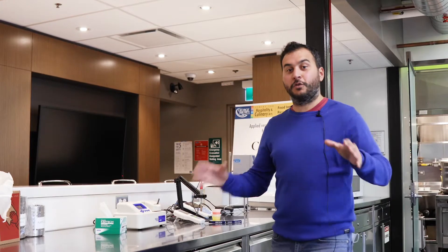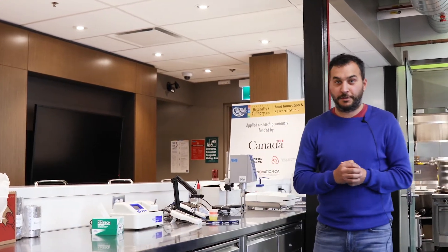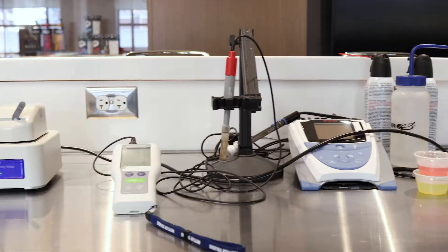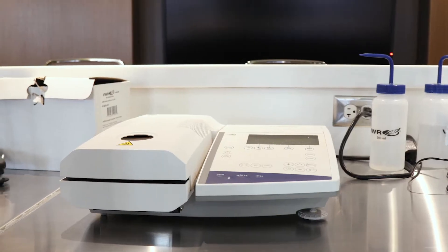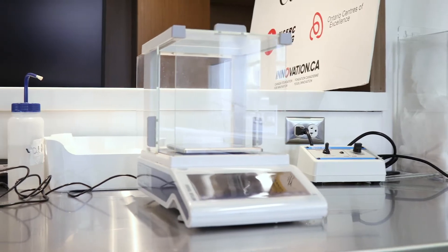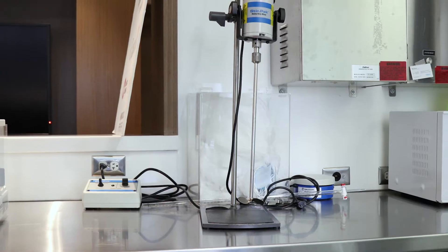Welcome to the quality control section of the Food Innovation Research Studio. Here we have a water activity meter, moving along we have a pH meter, we've got a viscosity meter, here you're going to find a moisture meter, and moving along we've got a precision scale and a heavy-duty mixer.